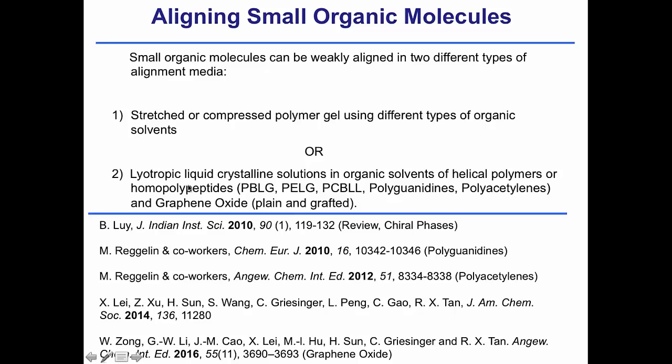I mentioned to you that preparing lyotropic liquid crystalline solution is not easy. In my experience, it's always been very difficult. And I spent 10 years of my life developing gels and working with gels. So I will concentrate and share with you my experience working with gels. Also here you have listed references: these are reviews for chiral phases, some papers on polyguanidines and polyacetylenes, and two references about graphene oxide. The problem is that probably most of these phases are not commercially available.